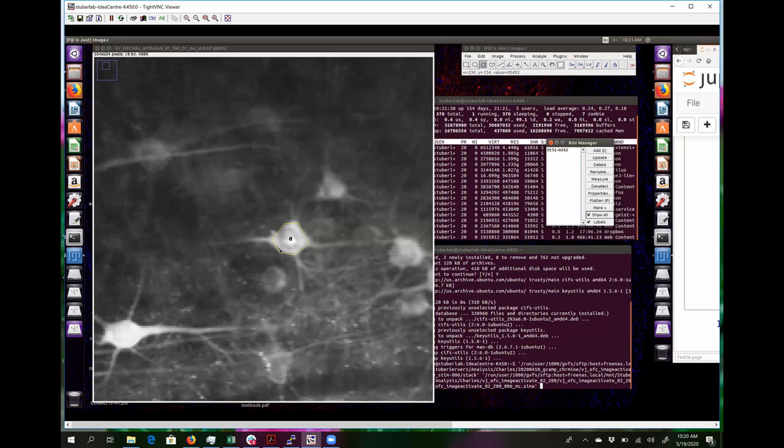That's hard to be really sure about. I spend a lot of time trying to make sure that there's pretty much zero motion, at least any that I can see by eye. But even with that, I'm sometimes not certain that there isn't any motion at all on any frame. So because of that, I find it safer to draw the ROI not like this, covering the entire cell, but instead like this, covering most of the cell, but maybe not the entirety of the cell.